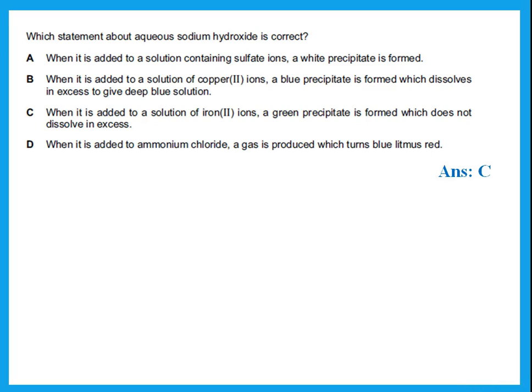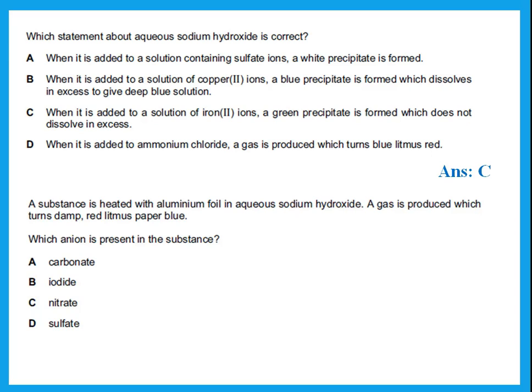Now, when it's added to ammonium, a gas is produced which turns blue litmus to red. Well, if I add sodium hydroxide to ammonium, I will get ammonia gas, but ammonia gas turns litmus from what to what? From red to blue. So that statement is not correct.